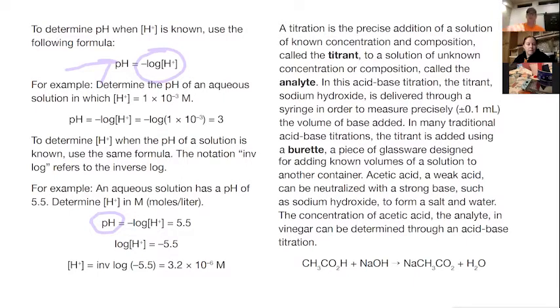So in this titration, we're talking about a titrant, which is what's known. That's the reactant that we know the concentration of precisely. And the analyte, what we're analyzing, is something that we don't know the concentration of.